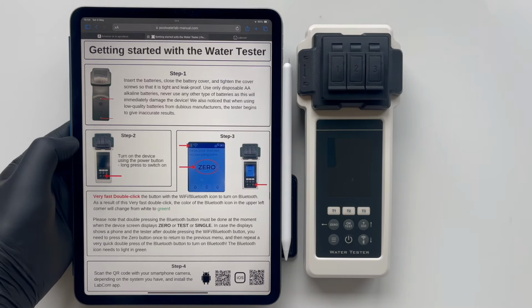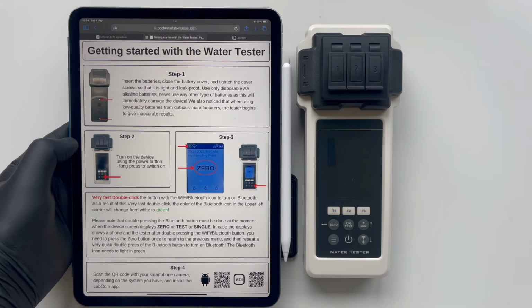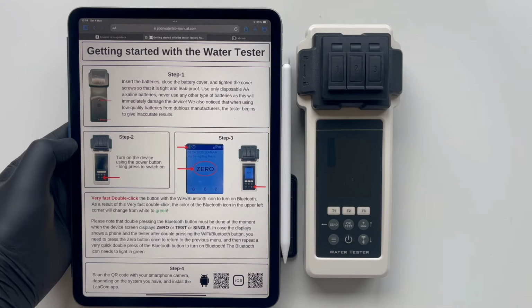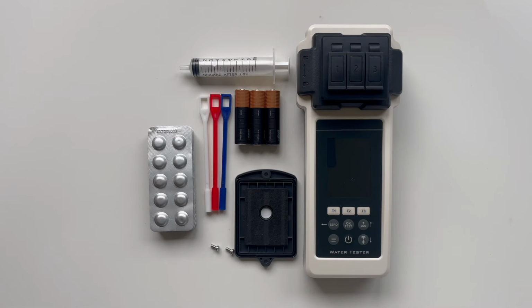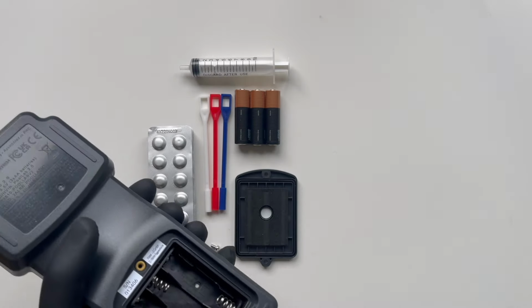Each step is designed to ensure you're fully equipped to use your device effectively, with helpful tips and visual aids to assist you along the way. We won't show the instructions themselves right now. Instead, we'll demonstrate exactly what you need to do. First and foremost, we need to install the batteries. There are 3 batteries required.